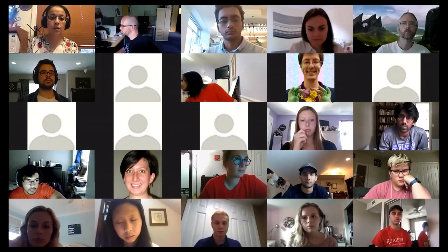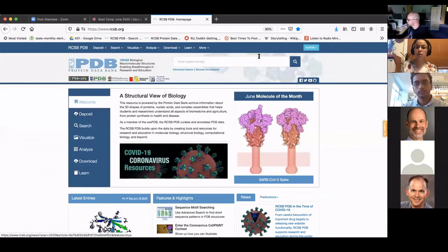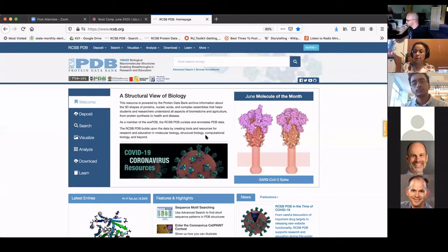I am going to share this screen now. Can everybody see my browser with the PDB homepage? Okay, so as an example, I'm going to use the myoglobin structure 1MBO to give you a quick tour, and we'll look at 4HHB, which has four chains, just so you get a sense of what a monomeric protein and a multimeric protein look like, and then you can go in and start looking at the exercise.